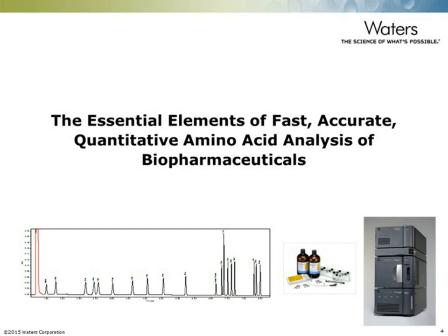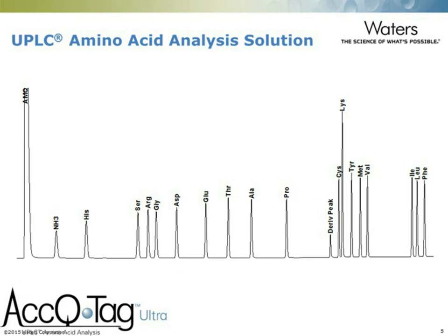Our work is centered upon a separation of the amino acids using UPLC, giving us a reliable analytical method. You'll notice in our basic chromatogram that all of the peaks are well separated, well identified, and sit on a flat baseline, which makes the quantitation very easy.